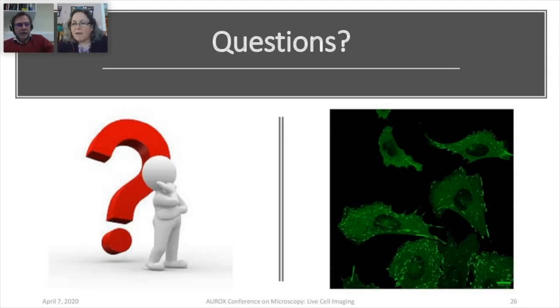There's a comment about maximum intensity projection versus summation of the images for the pseudo exposure time experiment. For the purpose of really simulating a longer exposure time, that's correct, a summation would be better. But we wanted to make sure that we really identified the objects precisely, which is why we chose the maximum intensity projection.